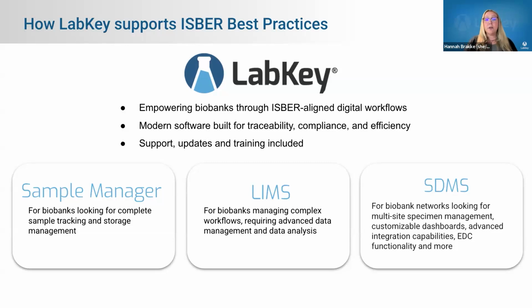And across all of these tiers, LabKey is very committed to providing training and support, so your team really can focus on the science and not the software troubleshooting, which is really our position.